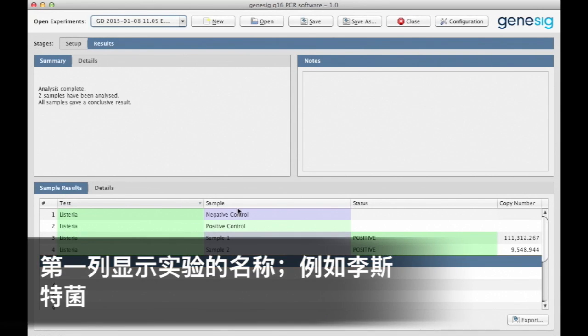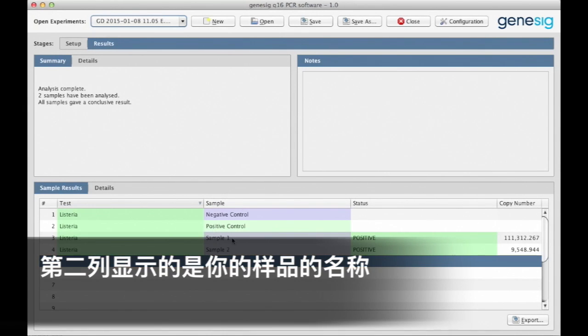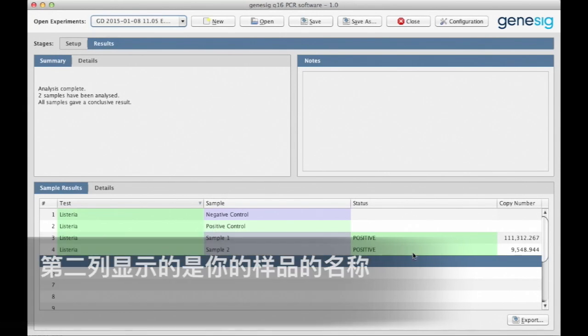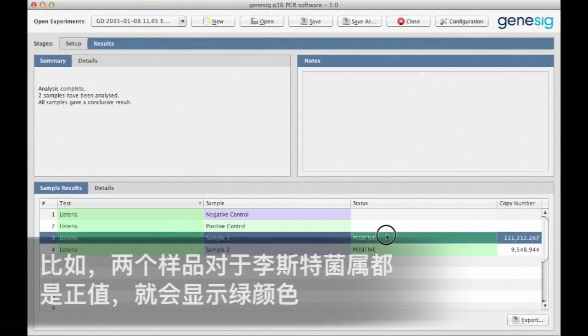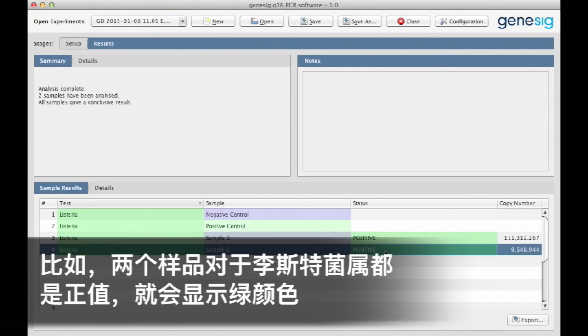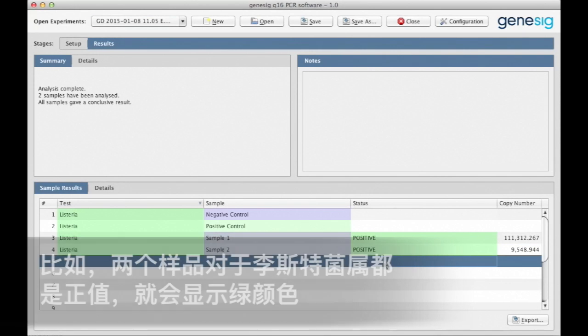So the first column displays the name of the test, Listeria in this instance. The second shows the name of your samples. The third is the most interesting. This tells you whether your sample is positive or negative for the target in a simple traffic light format. So in this instance, both samples are positive for Listeria, hence the green color.